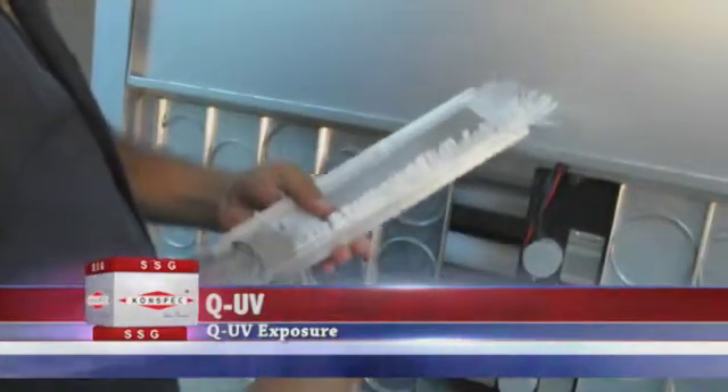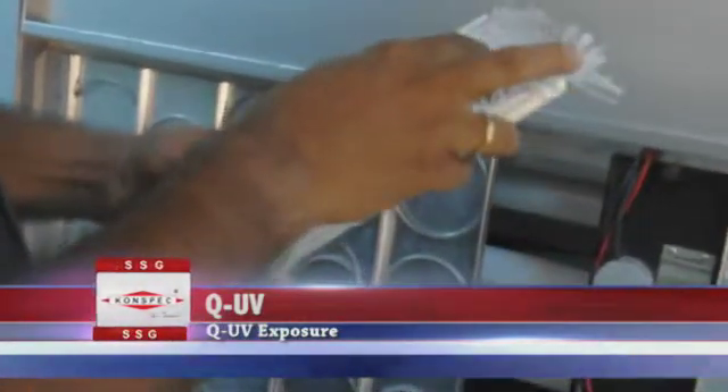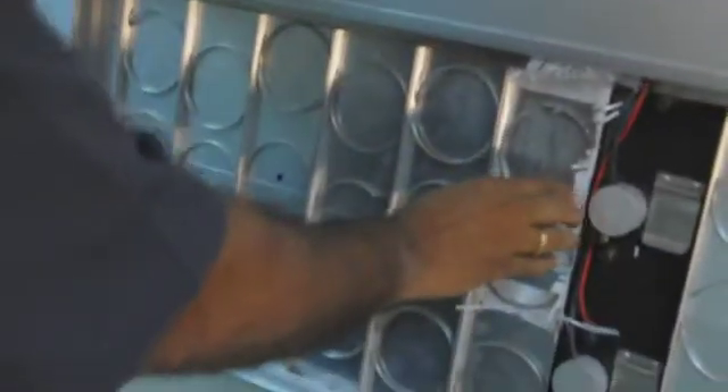the Q.U.V. tester exposes materials to alternating cycles of UV light and moisture at controlled, elevated temperatures. It simulates the effects of sunlight using special fluorescent UV lamps. It simulates dew and rain with condensing humidity and/or water spray.